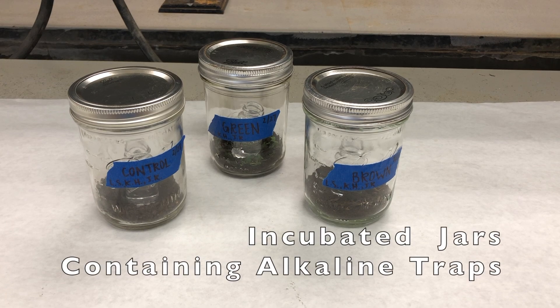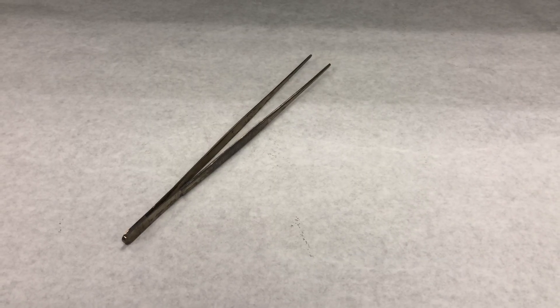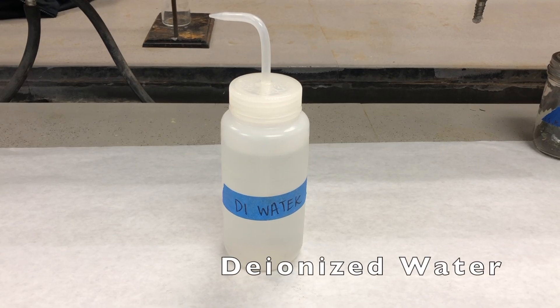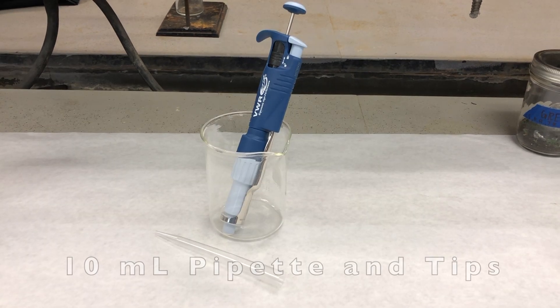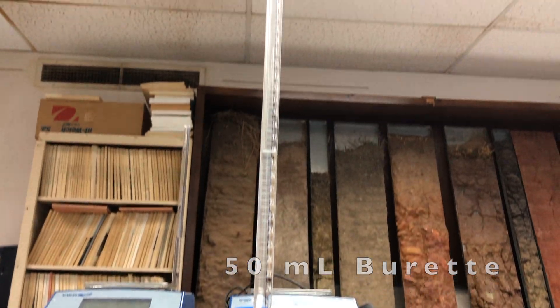To complete this portion of the alkaline trap method, you will need incubated canning jars with alkaline traps, long tweezers, three 250 milliliter Erlenmeyer flasks, deionized water in a laboratory wash bottle, a 10 milliliter pipette with tips, and a 50 milliliter burette on a stand.